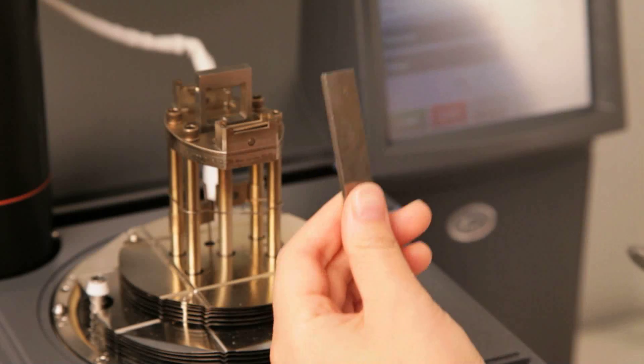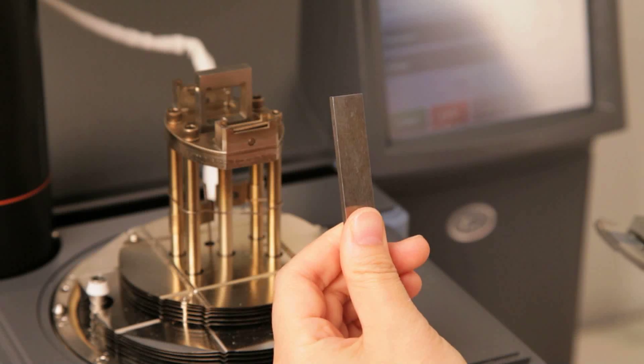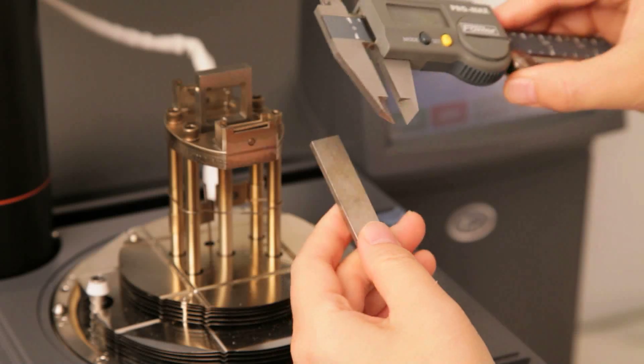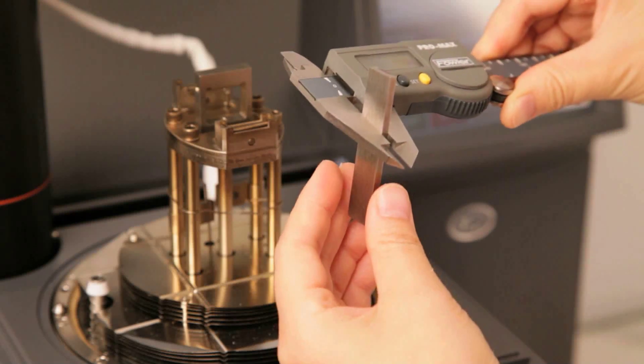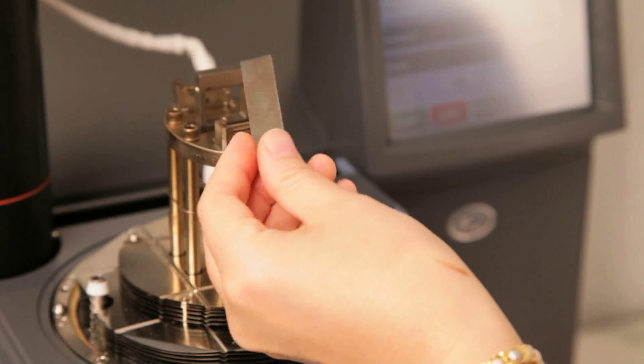For clamp compliance calibration, take the compliance steel bar from the clamp kit. Use a caliper to measure its width and thickness, then load this bar to the clamp.